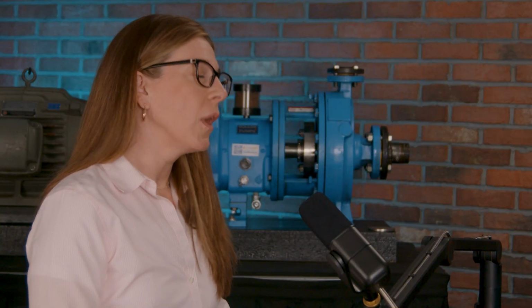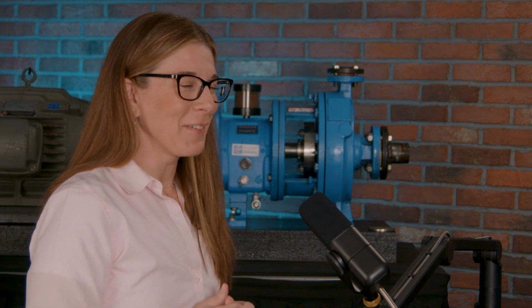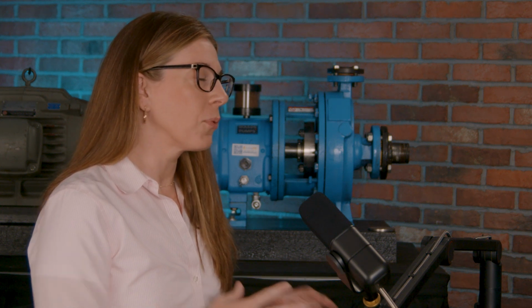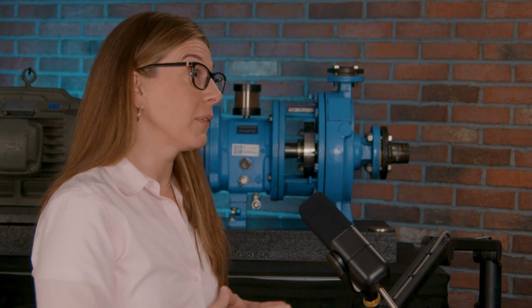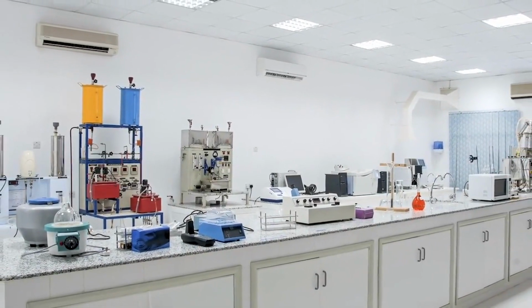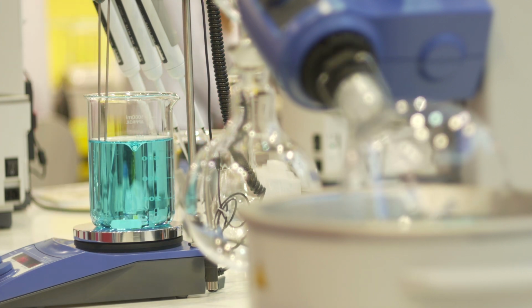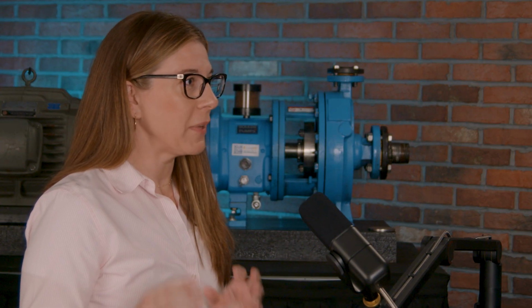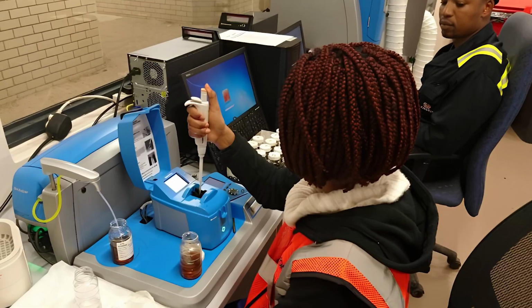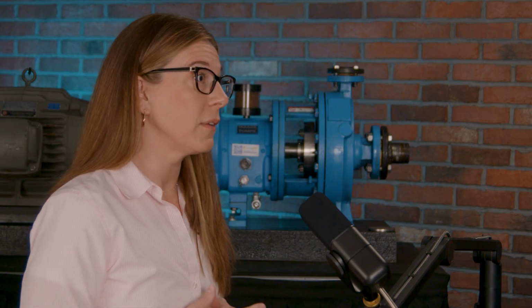Yeah, absolutely. So I have worked on the bench for 11 years. I worked in a third-party lab for many years, so I do appreciate that side of the business, really, and there's things there that are very valuable pieces to the oil analysis puzzle. So I will say that. But the on-site piece of this is critical in a number of ways. So the time part of it is really critical.